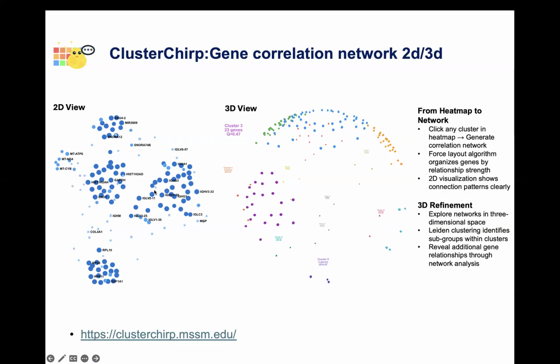So here we're looking at the same cluster, but in different ways, so that we will know within the cluster how your markers are correlated with each other, because it's not going to be a uniform correlation among cluster members, right? So now you have a cluster, but within your cluster, as you see, you have some subclusters.